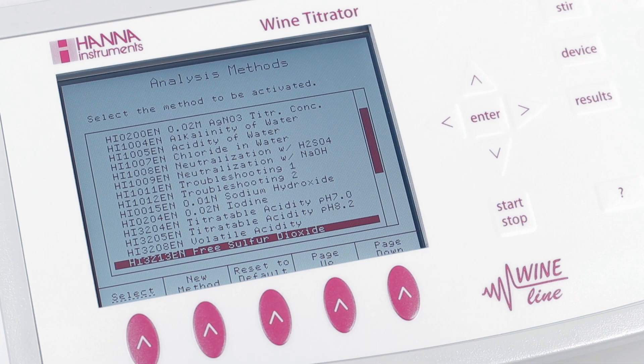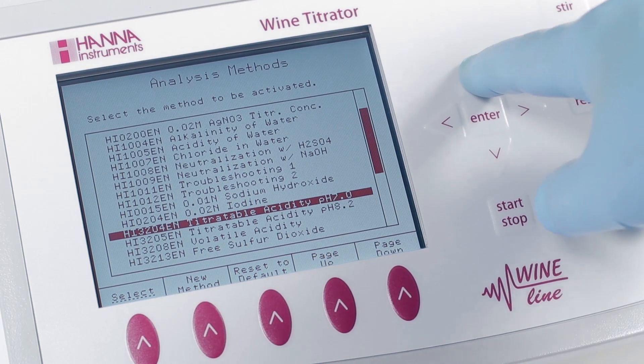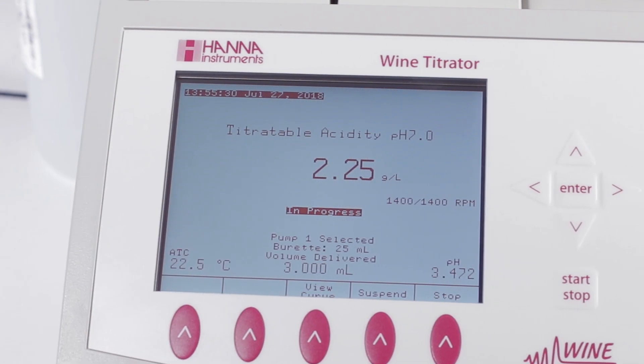The HI901W comes preloaded with standard methods for wine analysis, and with Hanna you get the support you need to run them in your wine lab. Titrate for a variety of measurements.